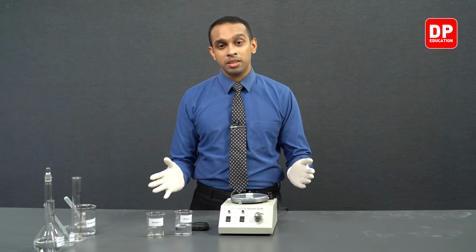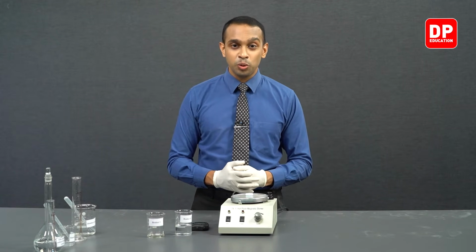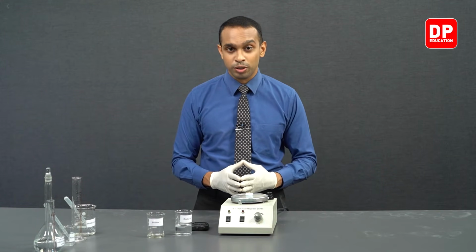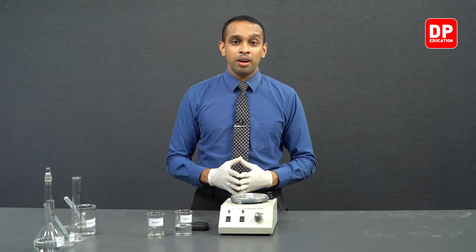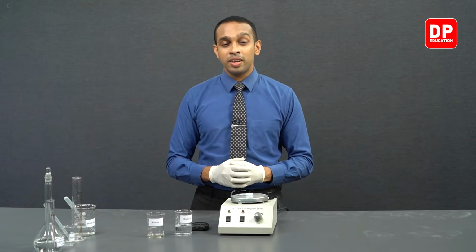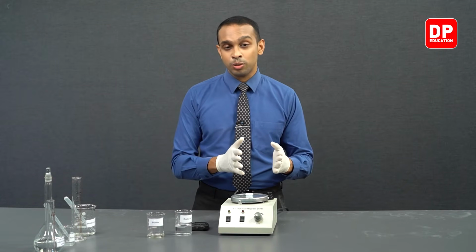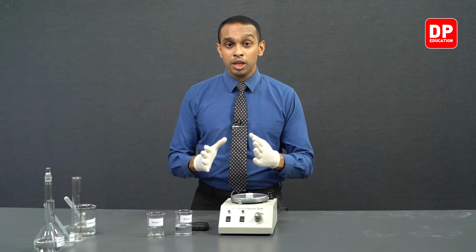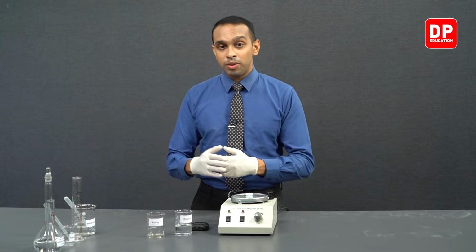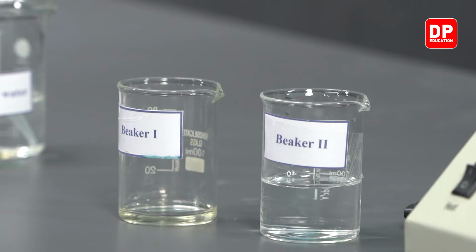If we don't observe a color change within 5 minutes, we can be sure that there's no color change going to be present, because like I mentioned earlier, if you do the calculations, you will see for yourself that the number of moles of iodine produced is going to be lower than the number of moles of thiosulfate present in the medium. So in this case, the amount of sodium thiosulfate present is more than sufficient to react with all of the I2 that is produced when we mix only 5 milliliters of the Fe3 plus aqueous ion solution into this medium.